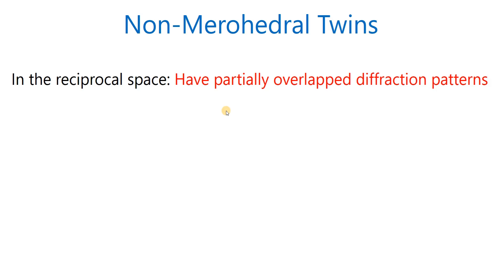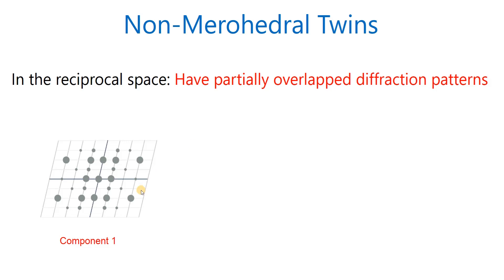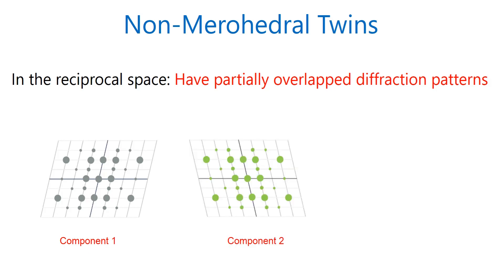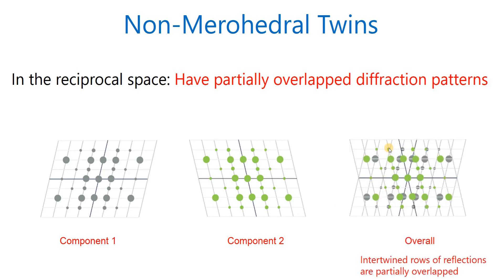In a merohedral twin, the diffraction pattern is completely overlapped, so it cannot be handled at the integration part. But we can handle the non-merohedral twin during data integration. Component 1 or domain 1 has certain reflections. Component 2 is shown in a different color. Overall, some reflections are partially overlapping. Intertwined rows of reflections are partially overlapped. In non-merohedral twin the reflections are partially overlapped, but in merohedral twin they are completely overlapped.